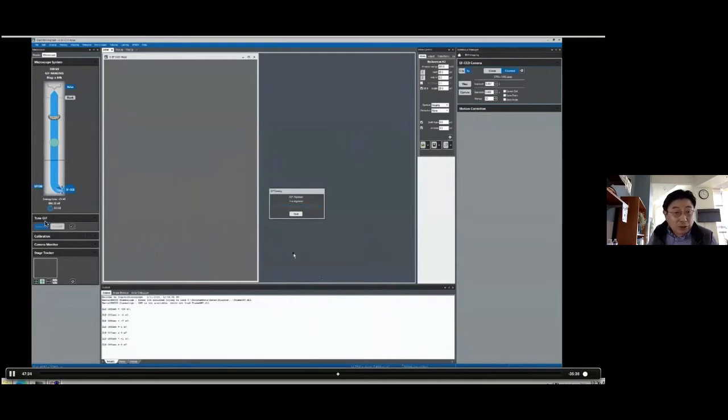And then I can do this zero loss peak tuning to make sure this is in the center. The zero loss offset was previously done multiple times, and now I did this one more time to be sure the energy in the filter is in the center. It's basically a line. Each step has to be done precisely. This is very good, so it's 0.